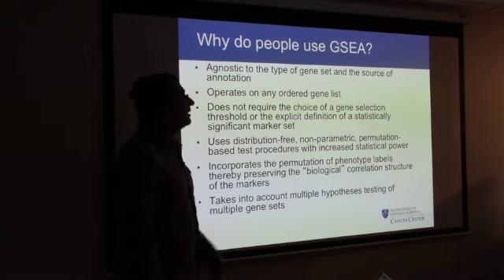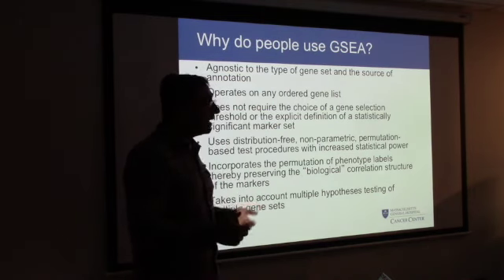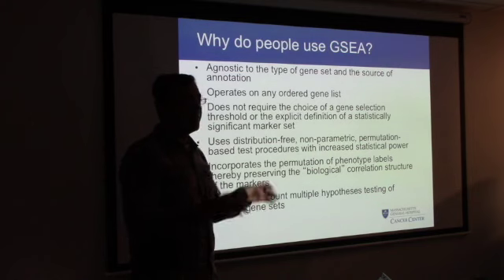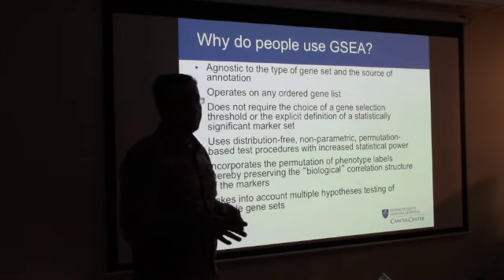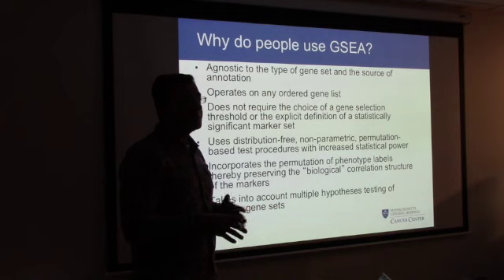Now, if you really want to get a little more in-depth, then you can run this with selected gene sets using command line, but that gets a little harder. So I usually don't go into that for this, but if you're interested, there's an R package called GSEA.